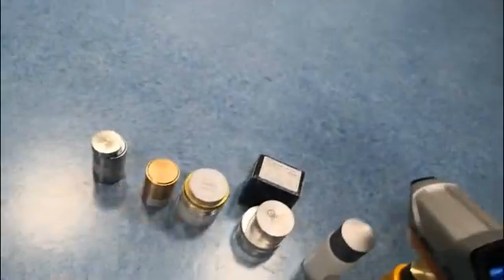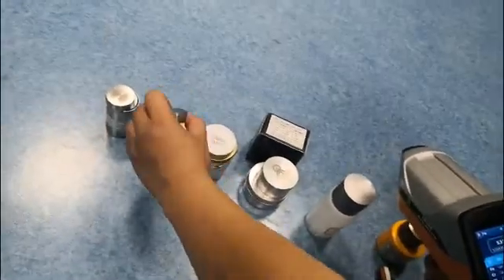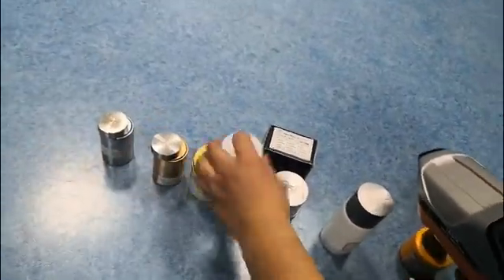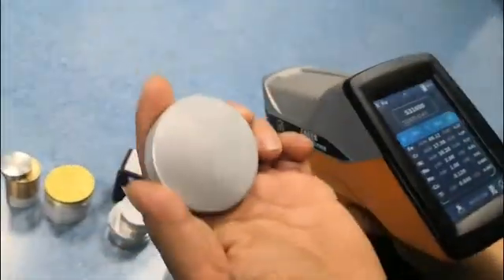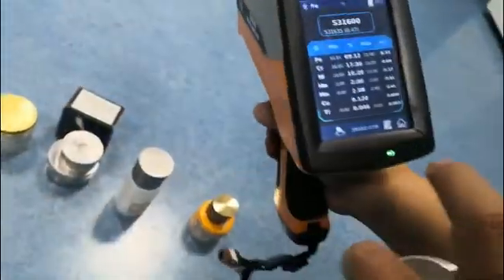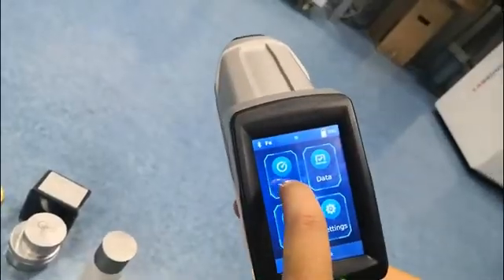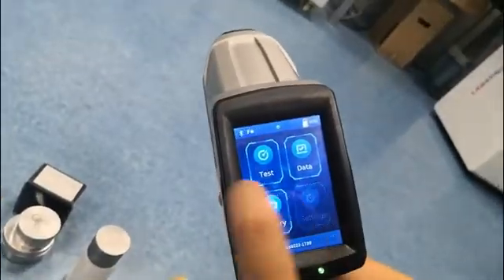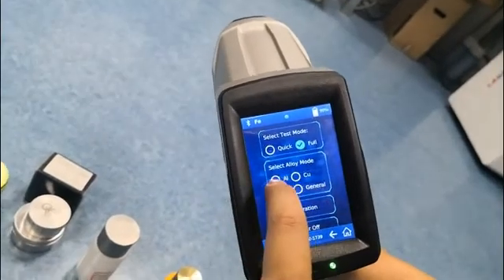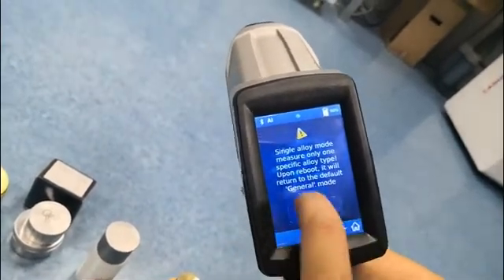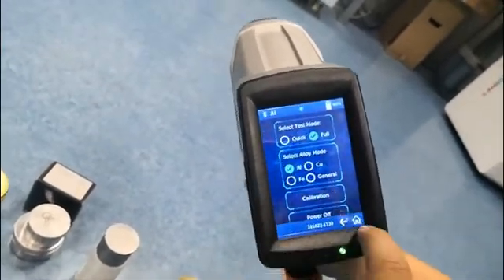Select the material. Now we'll move to aluminum alloy. Setting, aluminum alloy.